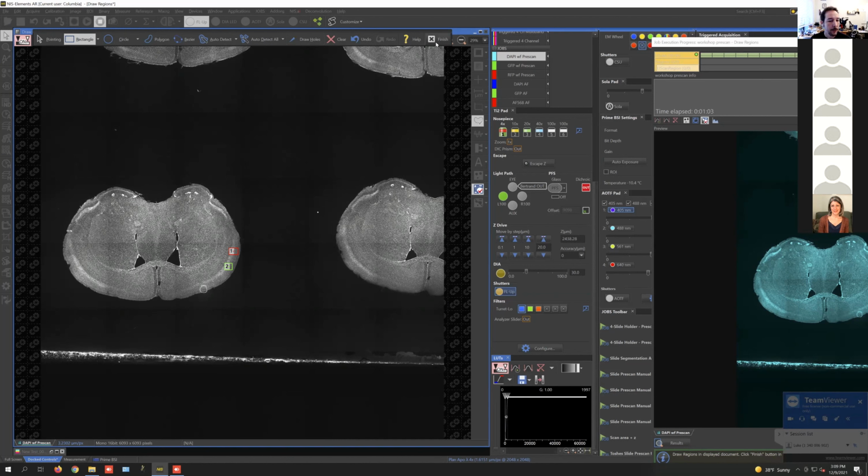We haven't tried this yet, but one thing you could do, if you're really interested in imaging just the hippocampus, is train it to do something like this and then draw around the hippocampus with these ROIs. It'd be worth trying to train the network to detect just those areas, because if they're visually different enough that you can see that difference, then neural networks are quite good at it if they're trained specifically for something like that.